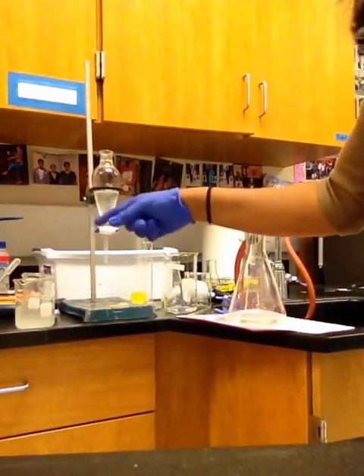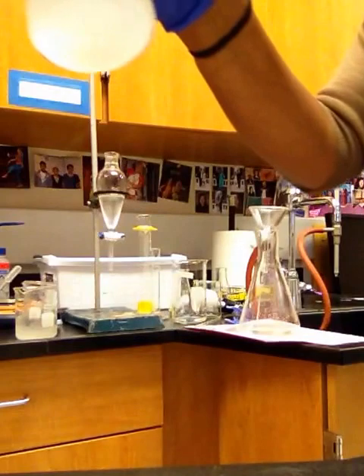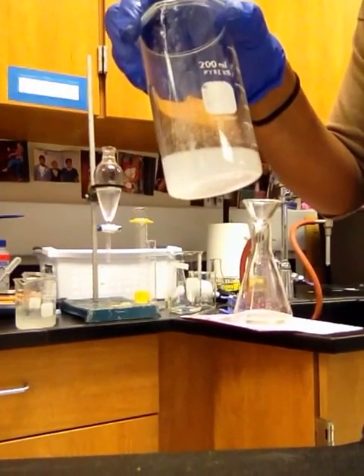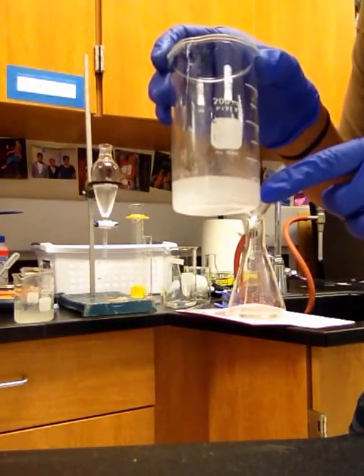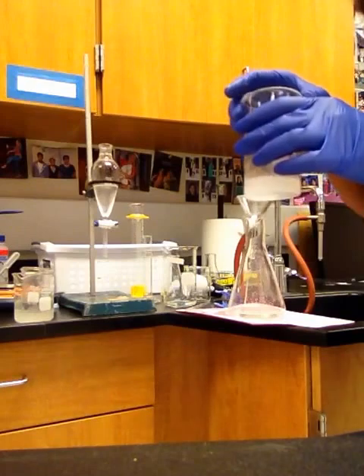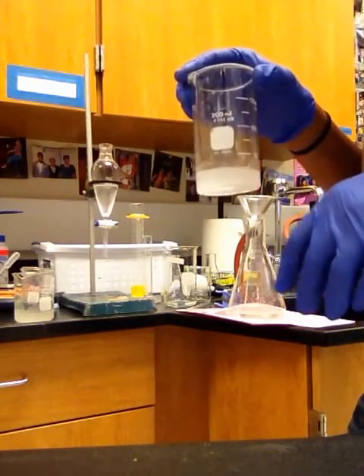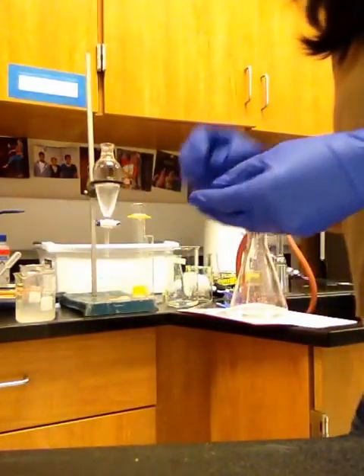I did that with a previous sample, and you see that it got turbid, meaning there is a precipitate or contamination in there. If you get a turbid solution, then you have to filter it out using a Buchner funnel again. Make sure to pre-weigh the filter paper at this point. So that would be our aspirin.